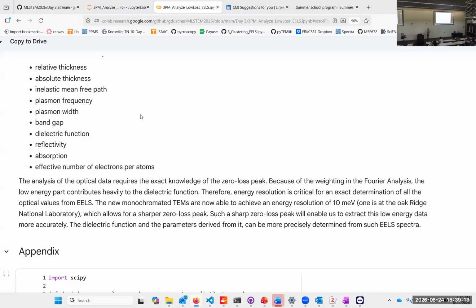We discussed it earlier. We have some retardation processes, so Cherenkov radiation. If any of you ever looked into a nuclear reactor, it has some kind of blue light, right? So the particles are faster than the speed of light in there. And so that's the same thing. The electrons are faster than the speed of light within the material. And that is the Cherenkov radiation or retardation processes.